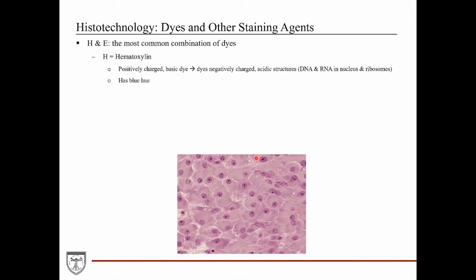And hopefully your eyes are going to these circular structures. These are all nuclei, and these punctate darker purples in the center are the nucleoli, where the ribosomes are assembled. So nuclei, nucleoli, these things that stain well with hematoxylin are said to be basophilic in nature because they're attracting the hematoxylin, which is basic in pH.